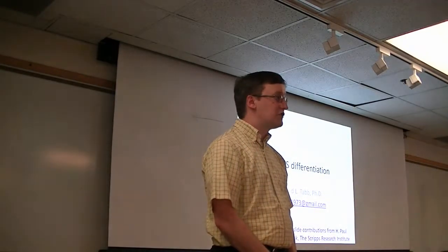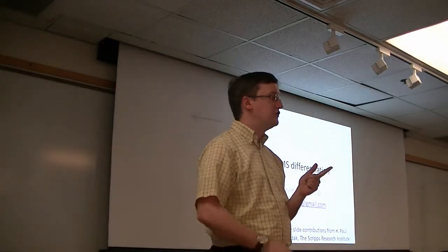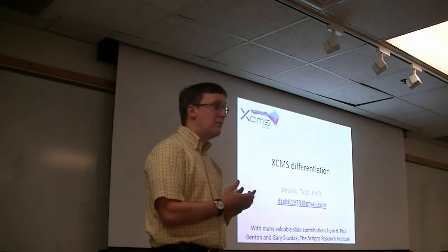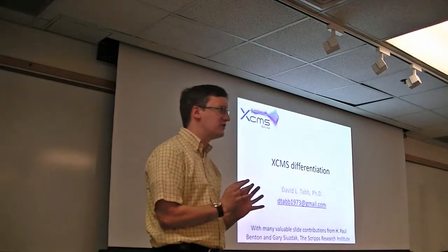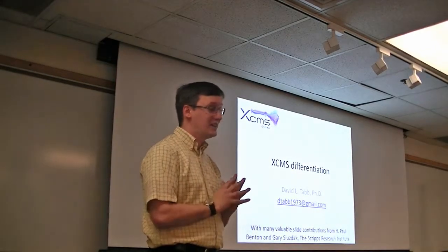In our preceding lectures, we've talked about how to do good peak listing. We've talked now about how to do retention time mapping and feature mapping across experiments. But before we start talking about how to harvest information from these reports, I think it'll be really valuable if we spend some time talking about statistics.